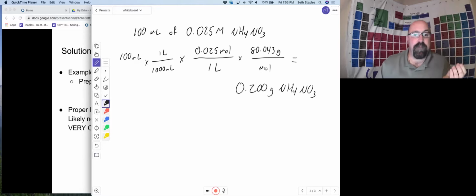And so that's making a solution from our solid. Even though you're not going to make them yourselves, your pre-lab does have you doing the same exact calculation for all the other solids. Make sure that you know how to do those, and that you can work through your pre-lab to find that information. Just make sure that you are looking carefully at the different volumes, because there are different volumes for some of those, on page 43 of your pre-lab. Those will be some different calculations.